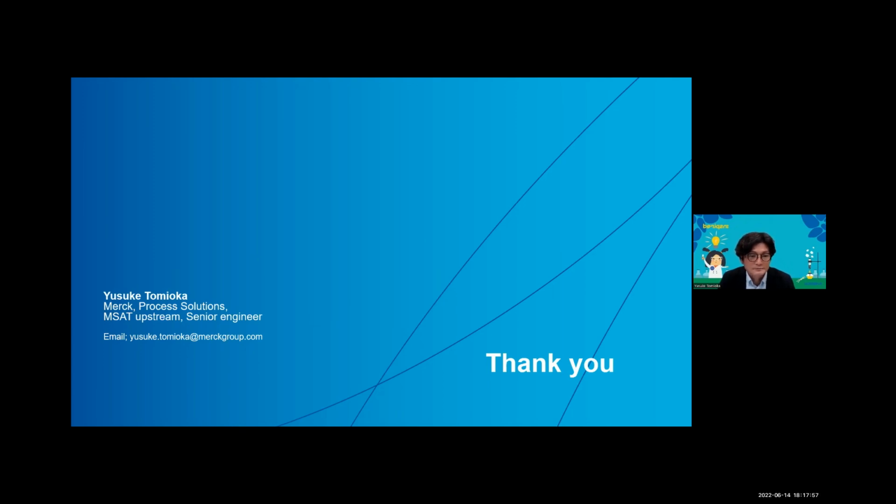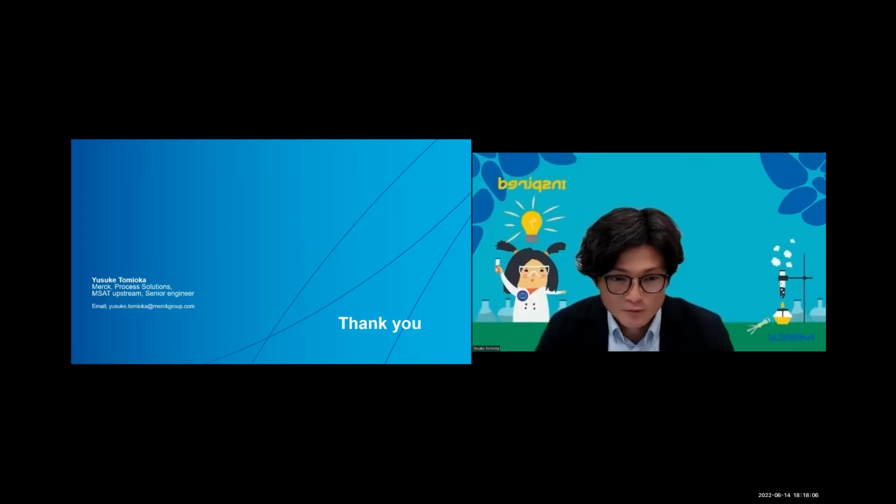In the case of cross validation, some of the data set is removed from the data set automatically by the PAT software.